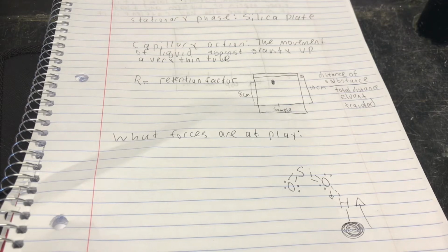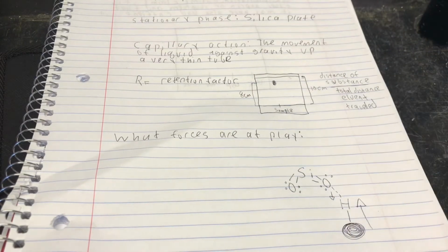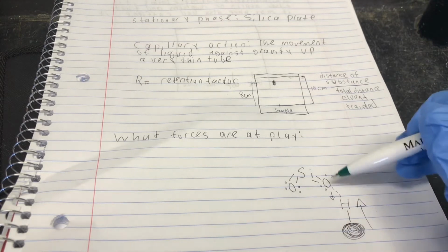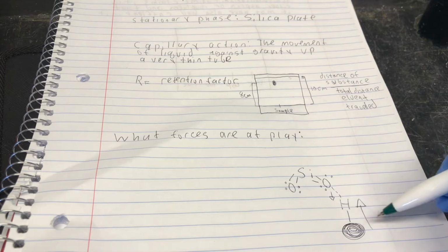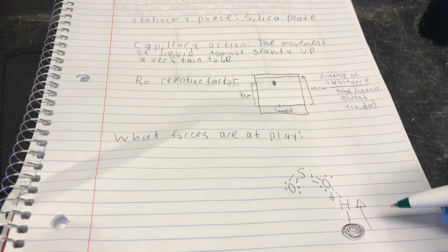The gist of it is that the silica in the plate, that's this right here, interacts with whatever you put onto it through dipole and hydrogen bonding. What that means is the higher the polarity of the substance you have, the more the oxygens are going to push down against the flow of the capillary action with your tested substance.